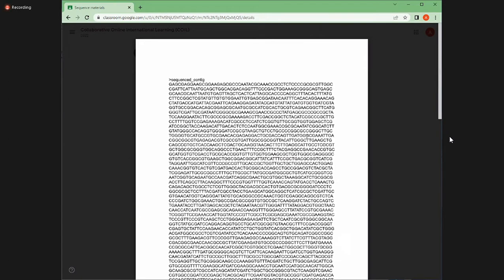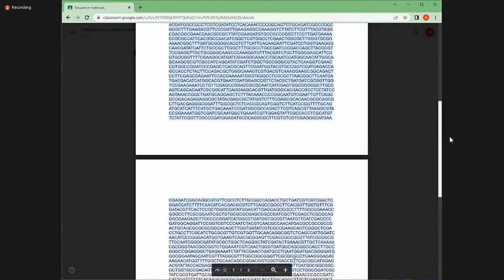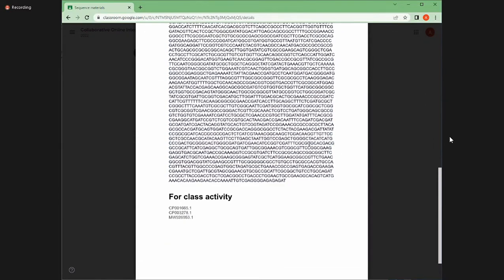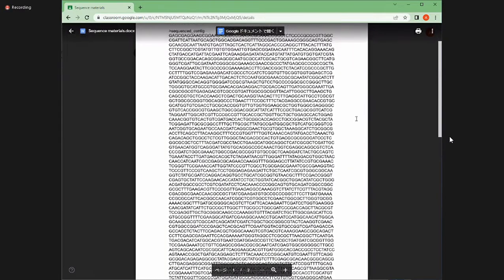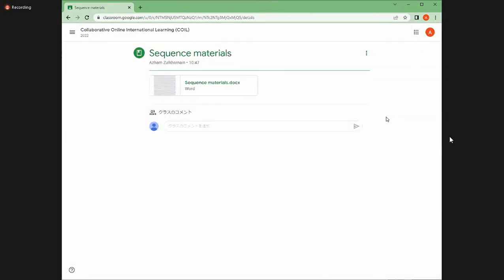Some portion will blast quite well, but it's not 100% because it's not the same sequence as the original bacteria that you can find from the database. So you can also compare that, first of all, the size, and then after that you can do an alignment comparison afterwards, so that you see the sequence. So I'm going to talk about that in today's lecture.